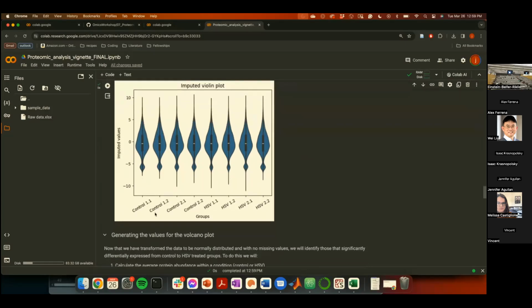After this, we're going to do volcano plotting. But before I do that, I want to pause a little bit to both give you time to run the cells and to ask any questions you might have.